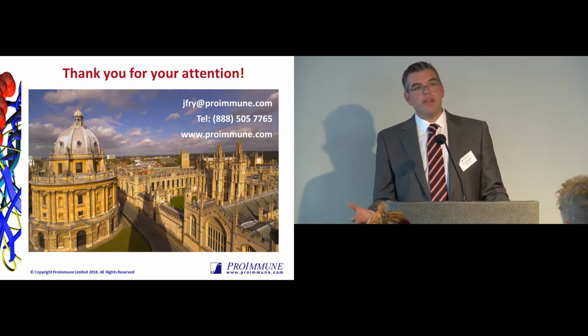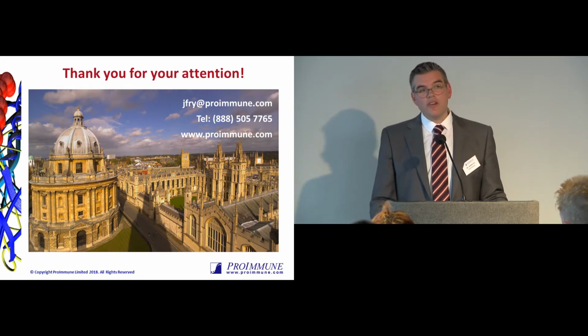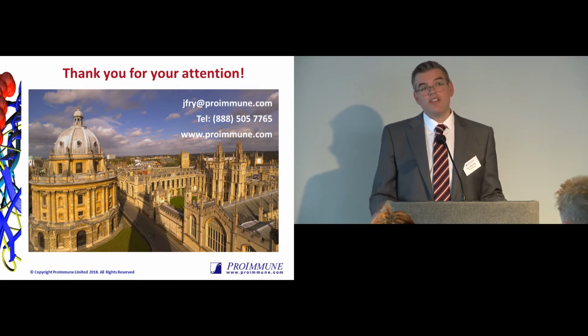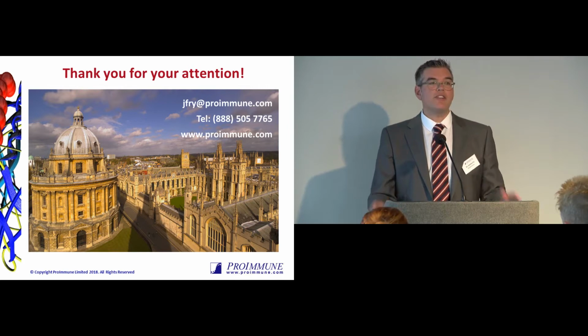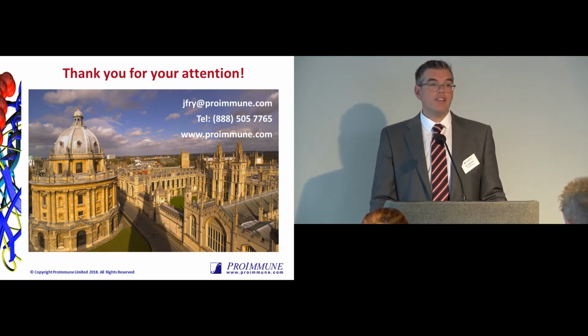The other thing, for example, in the other assay, like the dendritic cell T-cell assay, we're using a fixed molar concentration. And again, that's something which has been optimized. When we go down to a 10-fold reduction of that, then yes, you will obviously have a lower T-cell response to that protein. So actually keeping it the same is just one way of being able to do the comparison across multiple donors. But yes, you can do a dose response. That's not something that is impossible by any means. Right. So then the question is, which dose is more reflective of what's happening in vivo?